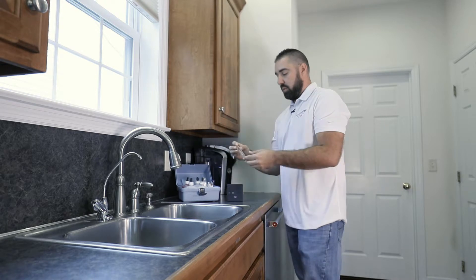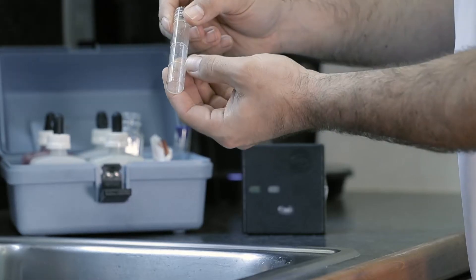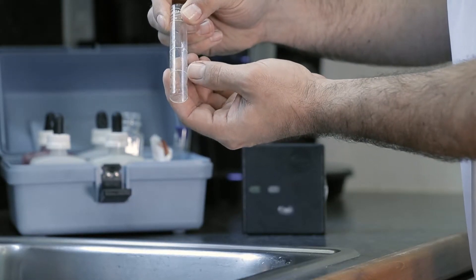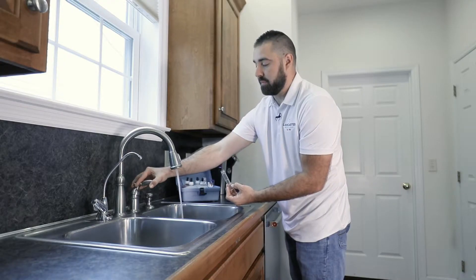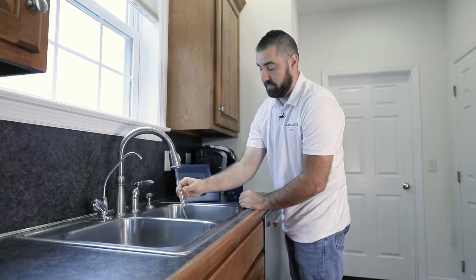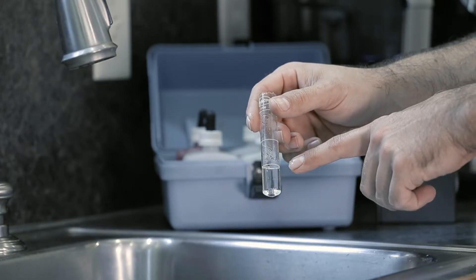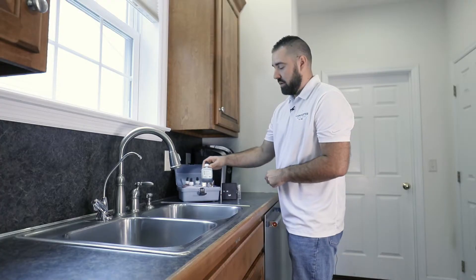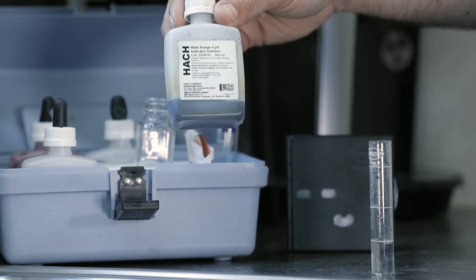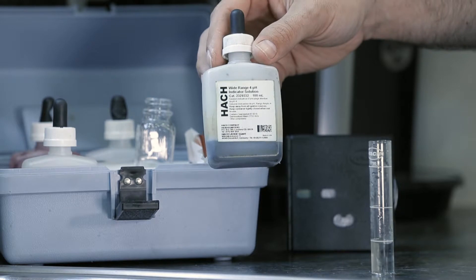First, begin with the 25 milliliter vial, using the first line as an indication for the fill mark. Once the glass vial is filled to the first mark, you can begin testing. To test pH, use the wide range 4 pH solution included in the kit.